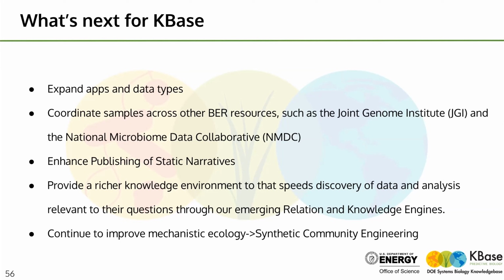And what's really exciting to me, and Shane and Paramveer are leading this, is providing this richer knowledge environment so we can place your data in the context of all of the data on the system. So when we were doing this analysis, one of the things that was very powerful was being able to show where the microbes that we consider to be important for nitrate reduction are also found in other metagenomes across the planet, and whether or not those were nitrate contaminated locations. So it speaks to the generalizability of the models that we're making in the system by instantly integrating it with everything else that can occur in the world.